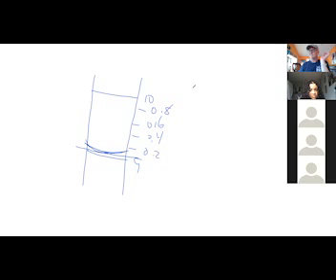Less. Well, some people would say more, some people would say less. So you can have a pretty good idea that it's about 0.1. If it's exactly halfway between, it's 0.1. If it's slightly less than that, it's a little less than that. But probably 0.1 is about as good as you're going to do.